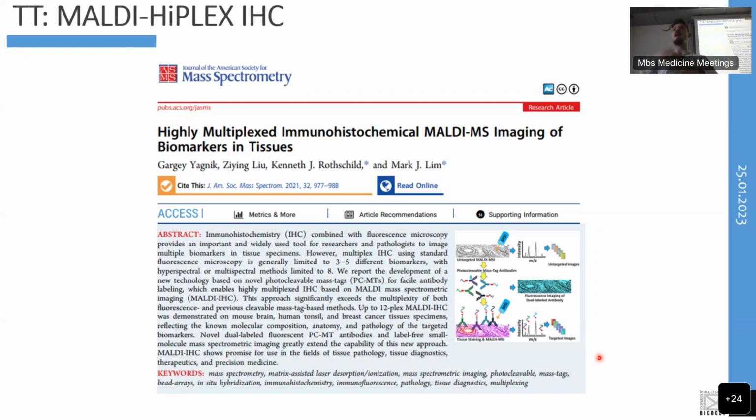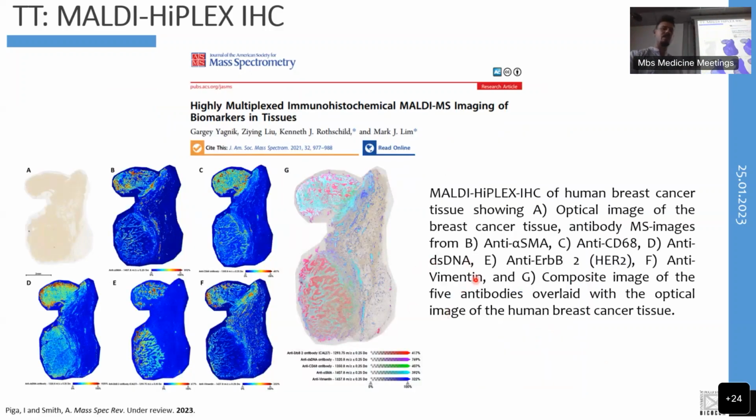And one of the advantages of this approach is that it can be compatible with the untargeted spatial omics analysis that I've shown previously. So first, you could analyze the lipid heterogeneity within the tissue and then see how this correlates to these specific cell surface expression markers. Again, this is an example that we generated recently in collaboration with the company that is producing these antibodies.